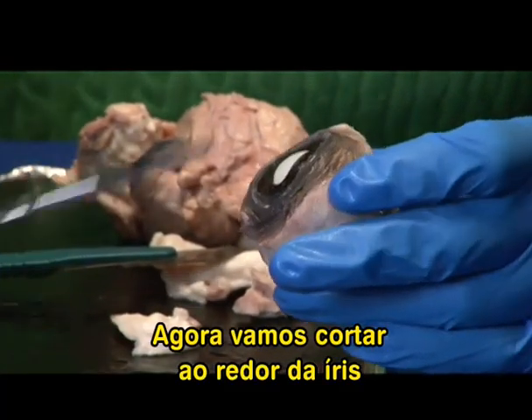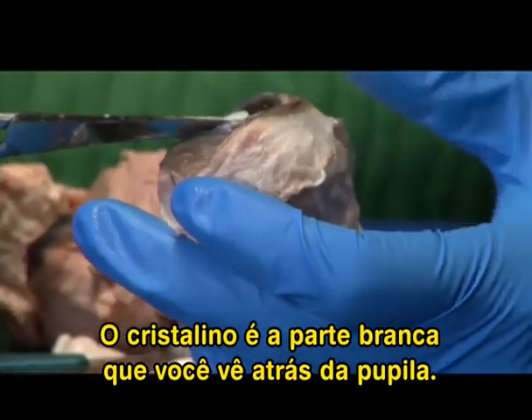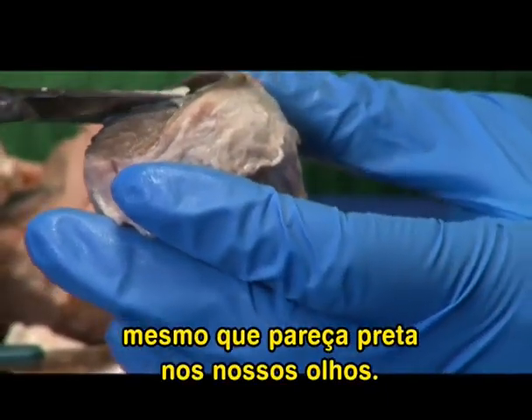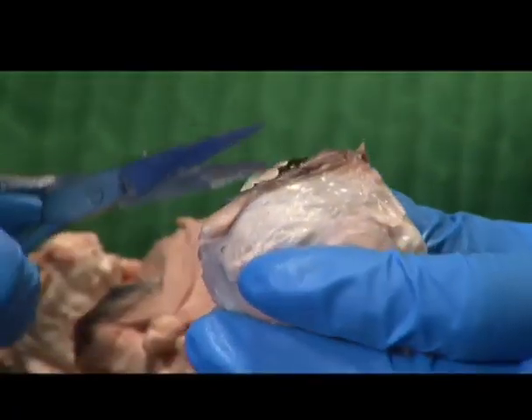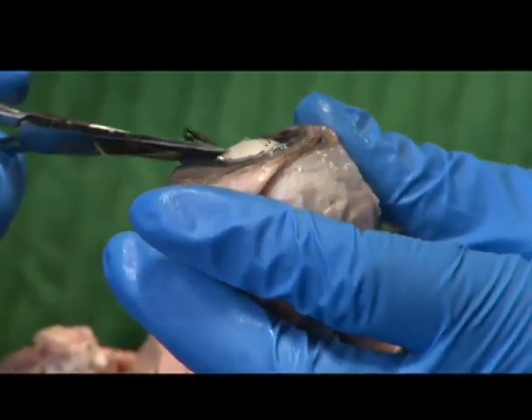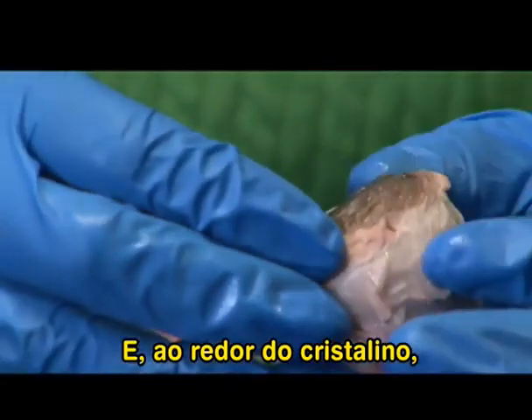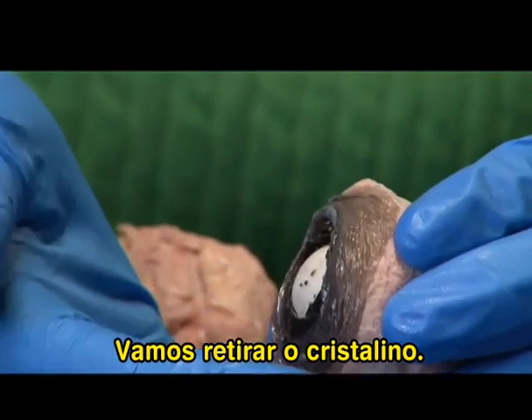Now what we'll do is we'll cut around the iris to expose the lens. The lens is the white portion that you see behind the pupil. So the pupil is actually just the hole that's letting the light through, even though it looks black in our eyes. So as we cut around, you can see the lens sits in the middle of the eye. And surrounding the lens, I'll show you later, is actually the ciliary body. So for now, I'll just pop the lens out.